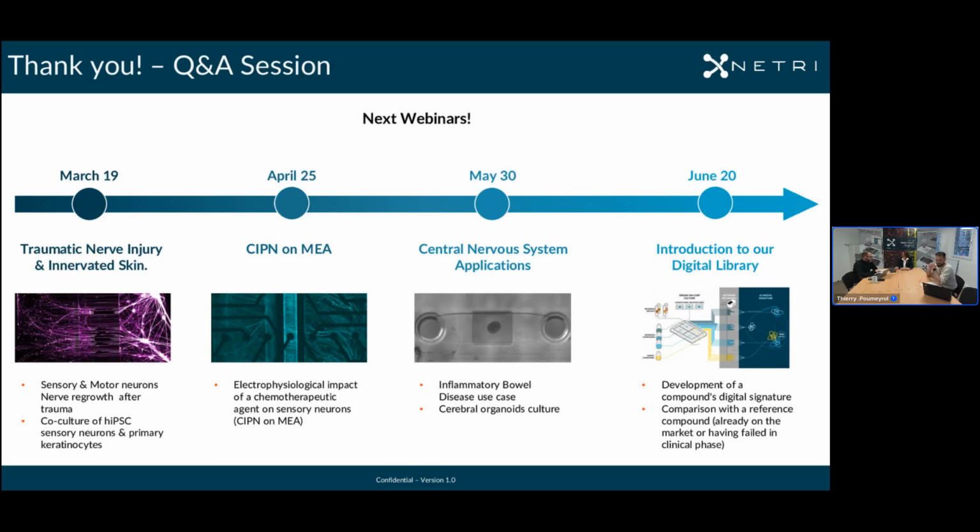Okay, excellent. Then I have a question for you, Benoit, this time. Can you describe the intended context of use for your organ-on-chip technology in studying CIPN? And I think there is basically a question behind, is it primarily for drug screening, mechanistic studies, or both? So actually they are for both. At the moment, most of our work is made for internal company decisions.